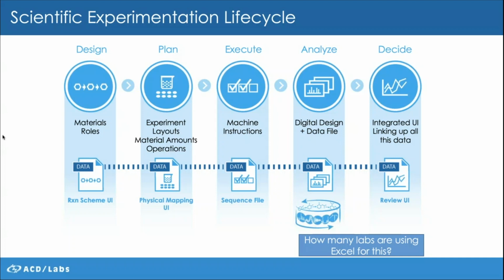And so what we hope you'll see today is a way to reduce that time spent in between software systems and spend more time performing and executing experiments, ultimately accelerating some of your drug discovery and drug development project timelines.